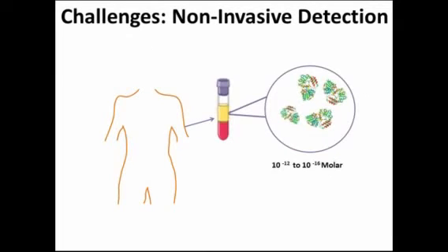For a biomarker to be clinically useful, analytical methods must be available that allow reliable measurement, optimally with capability for high throughput tests, prompt turnaround time, and reasonable cost. Current immunoassays measure proteins at concentrations above 10 to the negative 12 molar, whereas the concentration of the majority of proteins important in cancer, neurological disorders, and the early stages of infection are thought to circulate in a range from 10 to the negative 16 to 10 to the negative 12 molar among the sea of other biomolecules.